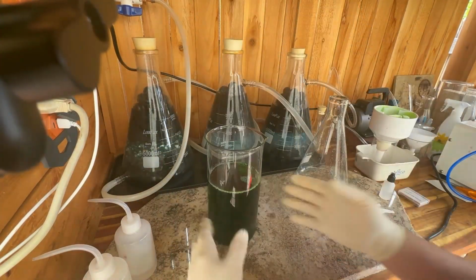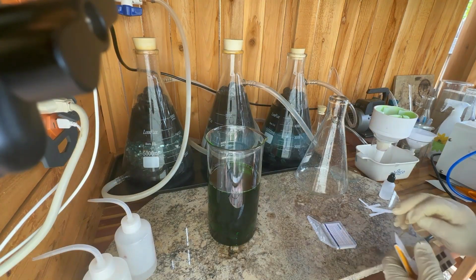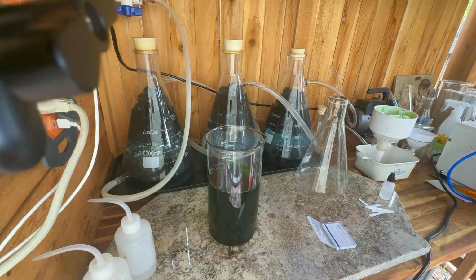You can see though, now that we got the junk out of there, it's not bad. That said, most of our drops and stuff we do require acidic solutions. I'm not exactly sure where this is, so I'm going to do a quick pH test just to be sure. It's acidic, ready to move on to recovery.